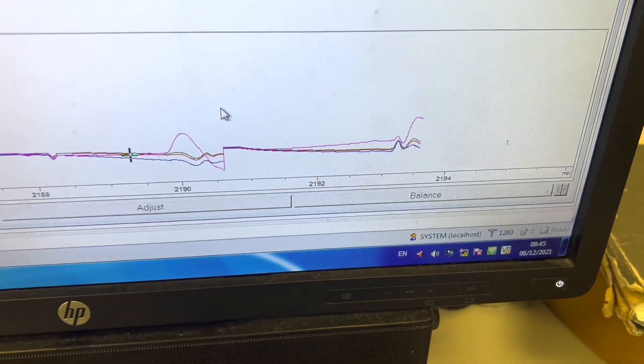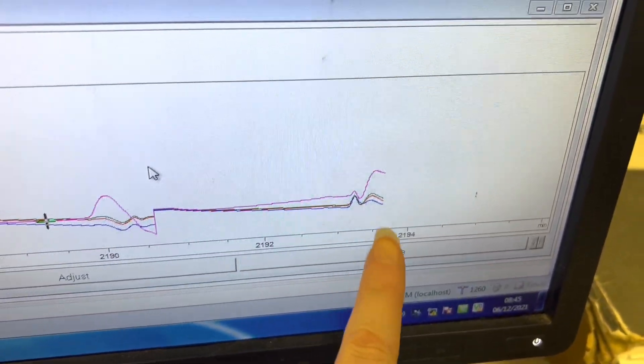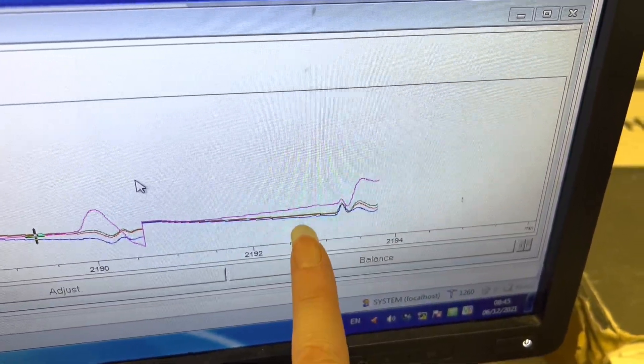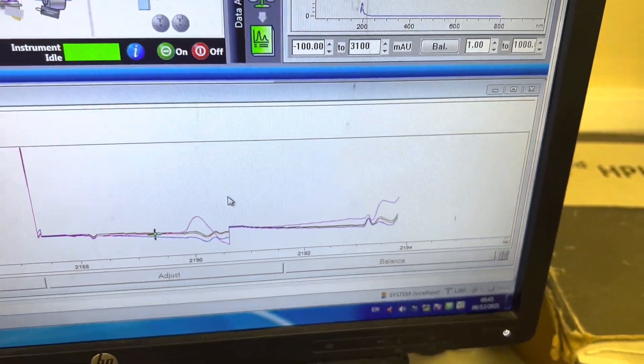This is why it's important to clean the column, because these are peaks which are coming out which could be some compounds from the sample before which was running. So always wash your column before you start your HPLC purification — always wash it.